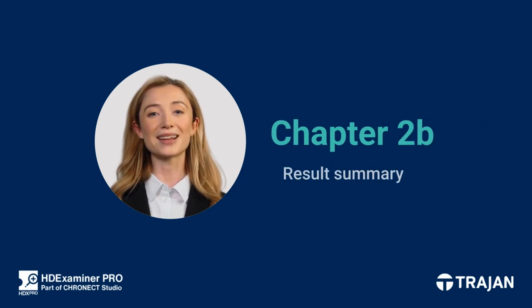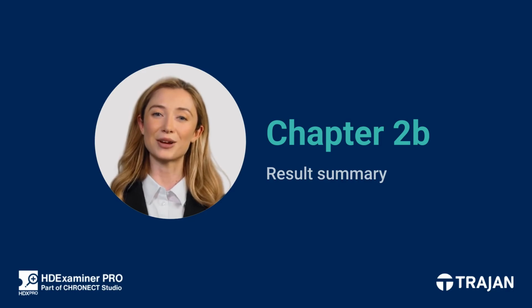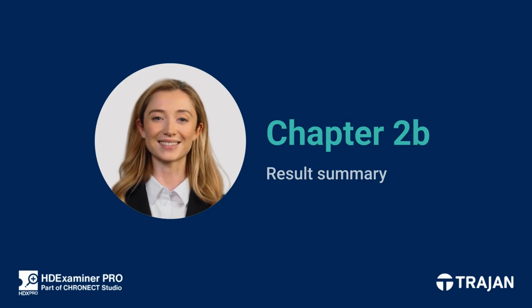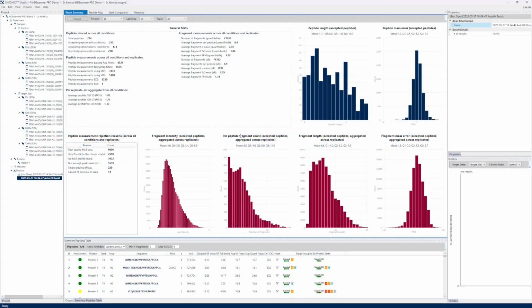Welcome to Chapter 2B. In this segment, we'll give you a quick overview of a processed HDX project and show you how to evaluate your results to start drawing meaningful insights. Let's take a look. All right, this is a fully processed project.